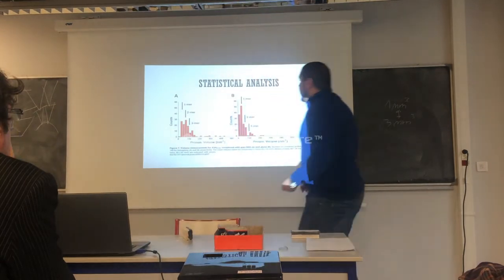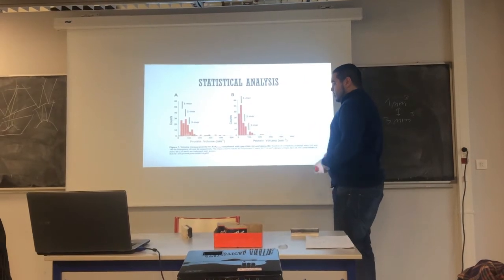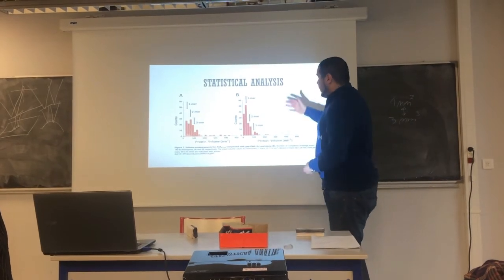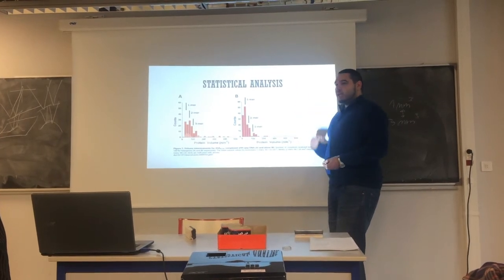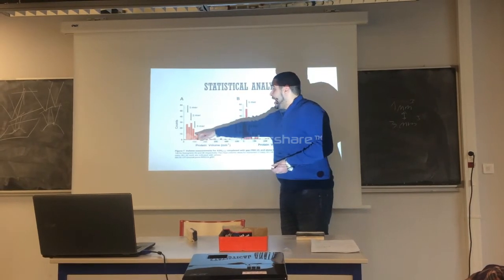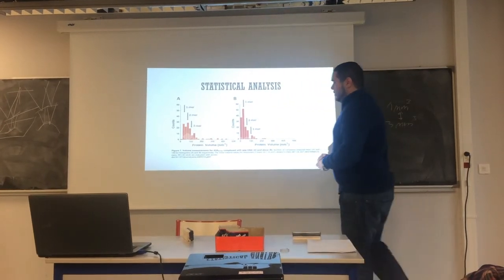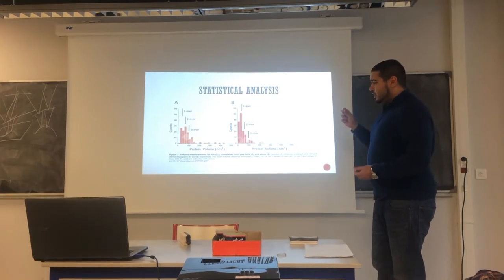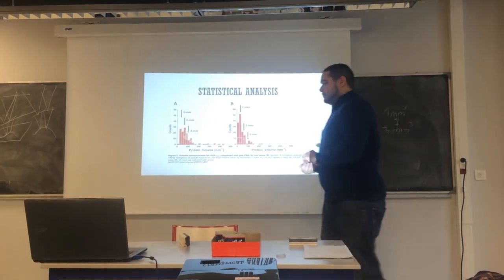So they move on to the histograms, and this is what we see. This is the difference between the A3A catalytic mutant and the A3A wild type. We see that the A3A catalytic mutant actually prefers to be in a monomeric state by itself in a solution, whereas in contrast, A3A wild type has the potential of multimerizing when it's bound to the DNA. Again, these visualizations were only possible for high ratios of protein to DNA.